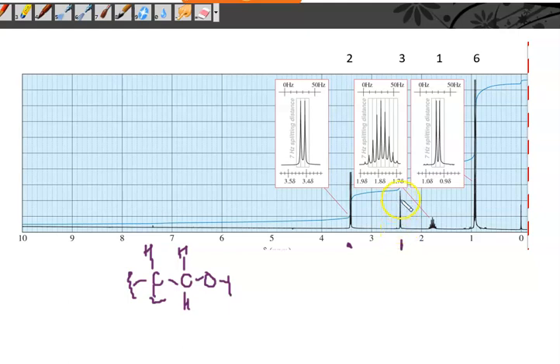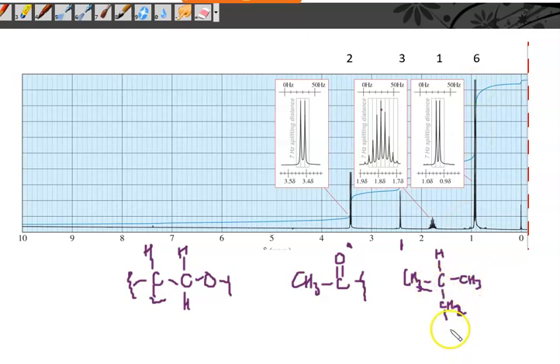Okay, next one is a singlet. 3 hydrogens. That's next door to no hydrogens, but it's in the carbonyl range, and I pretty much have figured out I probably have the carbonyl because there's 2 oxygens on this molecule. This one is 1 hydrogen. All right, 1 hydrogen. Yep, and here's 1, 2, 3, 4, 5, 6, 7, 8, 9. So again, that's the isobutyl group, or the isopropyl group. Well, in this case, it's isobutyl, because it's 9. So 6 there, and another 2 is 9. And then my CH3 next door to 1 hydrogen. I don't really have to write that.